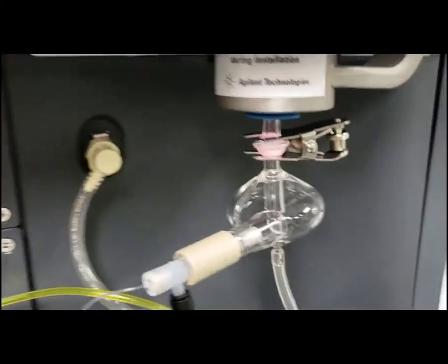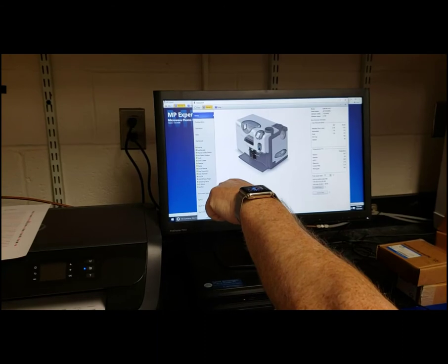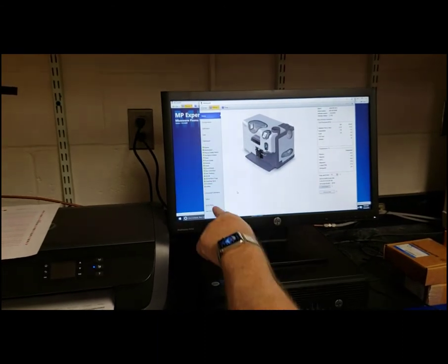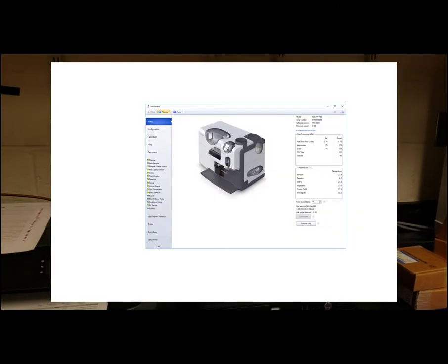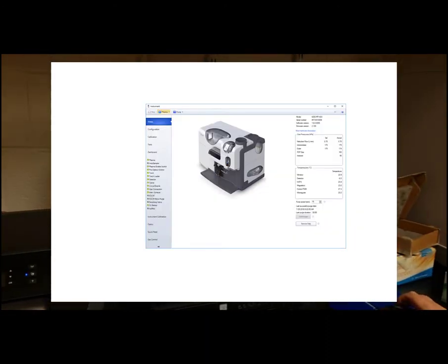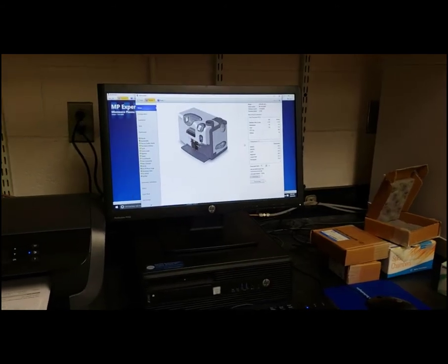Plasma light is green. So everything is lit. Everything is green for the way you have this configured. You don't have the auto sampler. You don't have these 2 modules. You don't have the switching valve, and you don't have the isomist. So if you took a picture of this, yes, this is exactly how your system will be when you light it with the green. And then now what we do is we just wait 20 minutes.